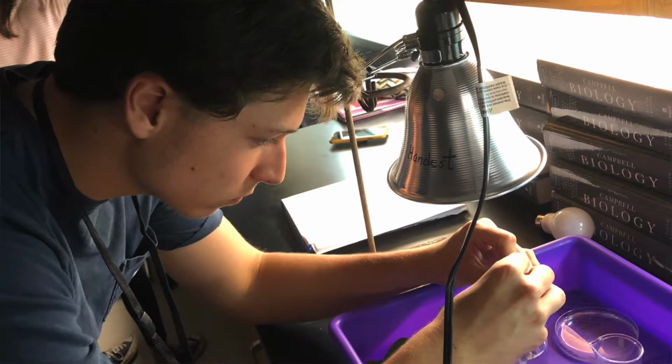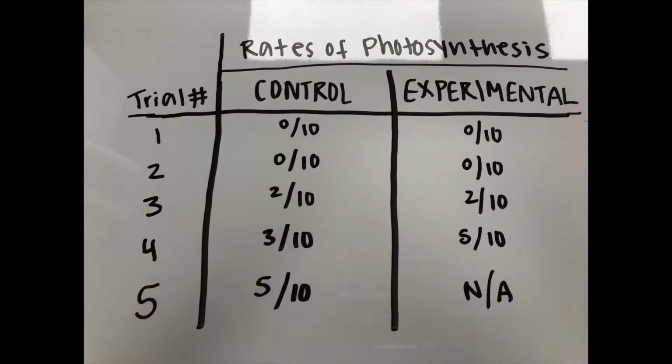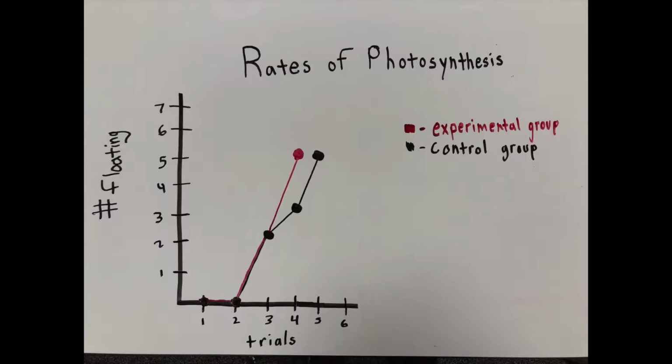After they sank to the bottom of the solution, we recorded all of our data with multiple trials. After all of the trials, we finished our lab and drew a graph of all of our data collected, and then we put our materials back into the back lab room, and that wrapped up our entire experiment. Also, each of the trials that we did was 1 minute long.